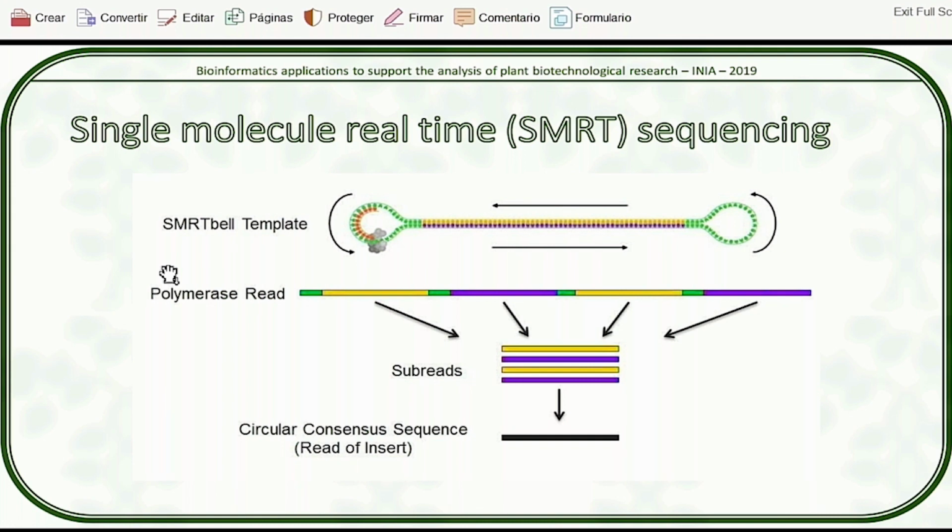Now, the most recent release of a polymerase chemistry from PacBio, they say that they can keep the polymerase attached for nearly 100 kb. So that means that for these smaller molecule fragments, you can get a lot more sequencing and therefore a lot fewer errors. But most researchers are not going to use it for this so-called circular consensus sequencing. They're going to try to increase the size of the template. It doesn't really matter if you get 2 or 3 rounds of each read. What you really want from this sequencing is long-range information. You want longer reads.